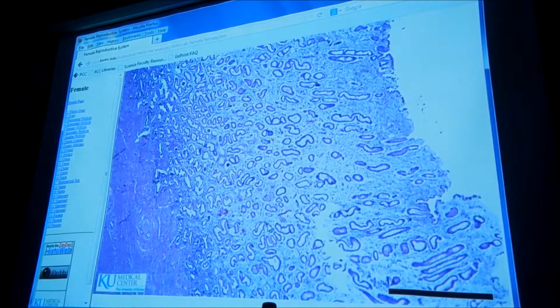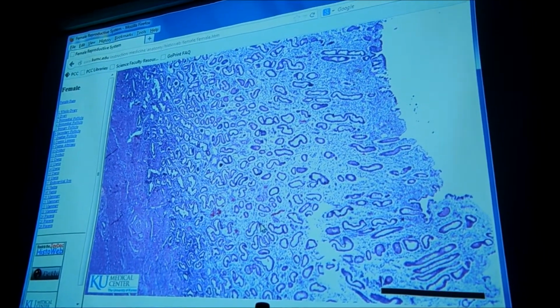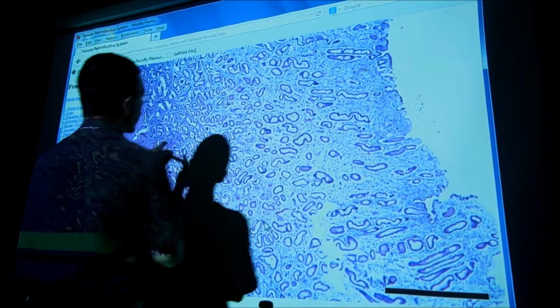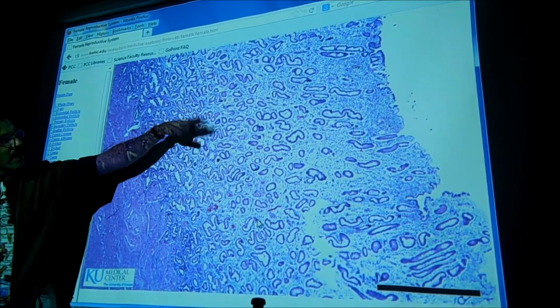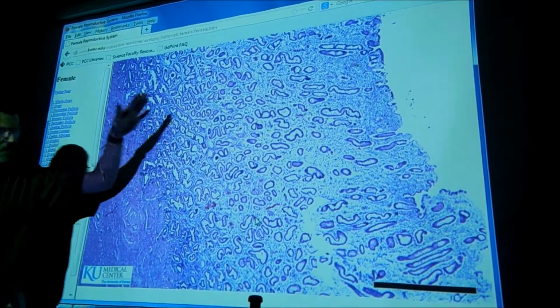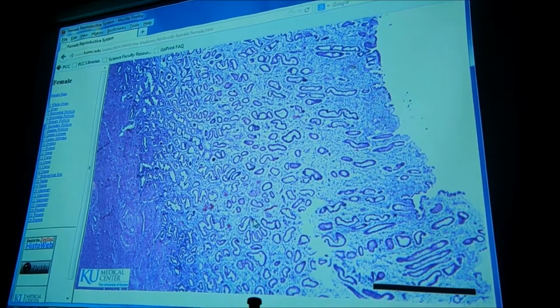Okay, compare what you saw in your head to this picture. Tell me about the glands. There's more of them. What else do you notice about their shapes? They're convoluted, like that word. It's very good. They're bent, corkscrewed. Very few of them are straight or round. They're a lot more squiggly.